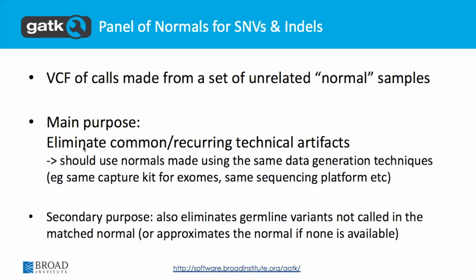Our standard recommendation is at least 30, but that's a really low number. Ideally, we typically work with, I think last I checked, several hundreds, like 500 samples. As you say, the more the better. But if you have fewer samples than that, whatever you have is better than nothing.